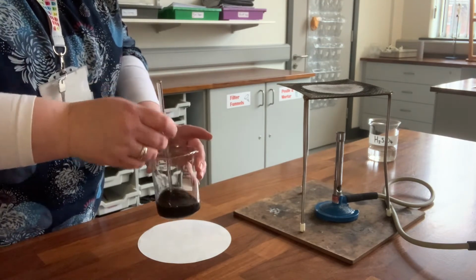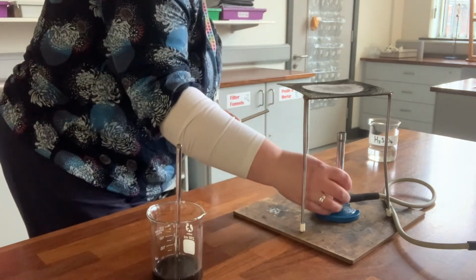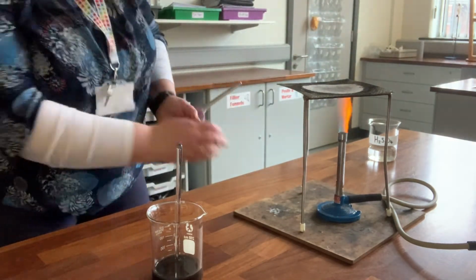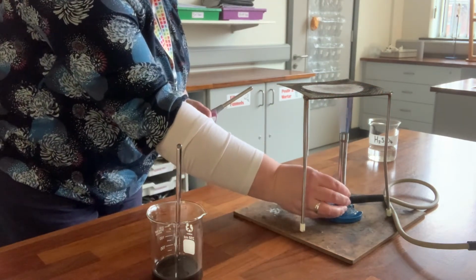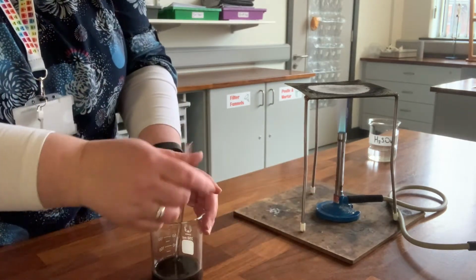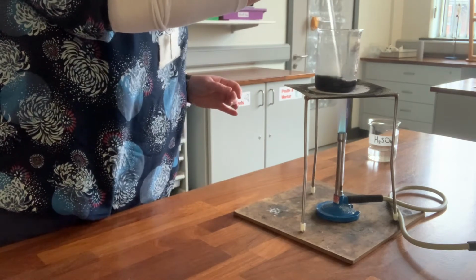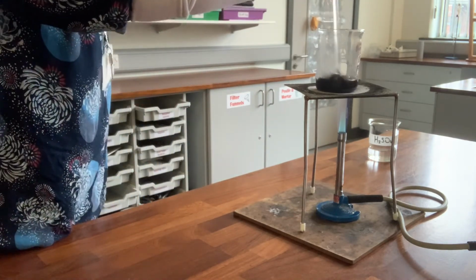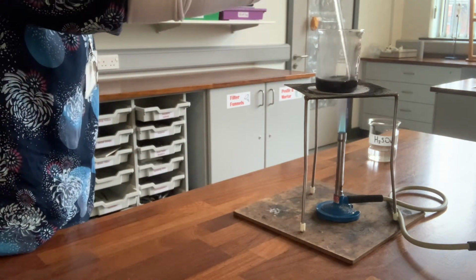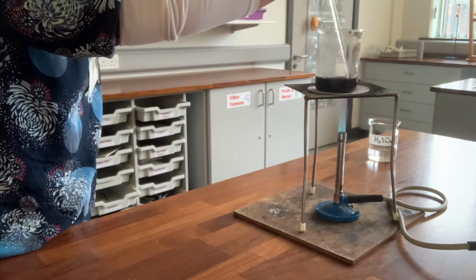Now, another way we're going to check that all the acid is neutralised is we're going to heat it gently. Now, we're not going to heat the acid too much. We only want to heat it to warm up the acid to react the copper oxide with it. We don't want the acid to start to boil. So I have my Bunsen burner on a lowish heat. We're going to put it on just for a little time to get the acid to react with it. And what you should be looking for is to see, is there any colour change happening, or can we still see the black powder, making sure that we still have the copper oxide in excess.